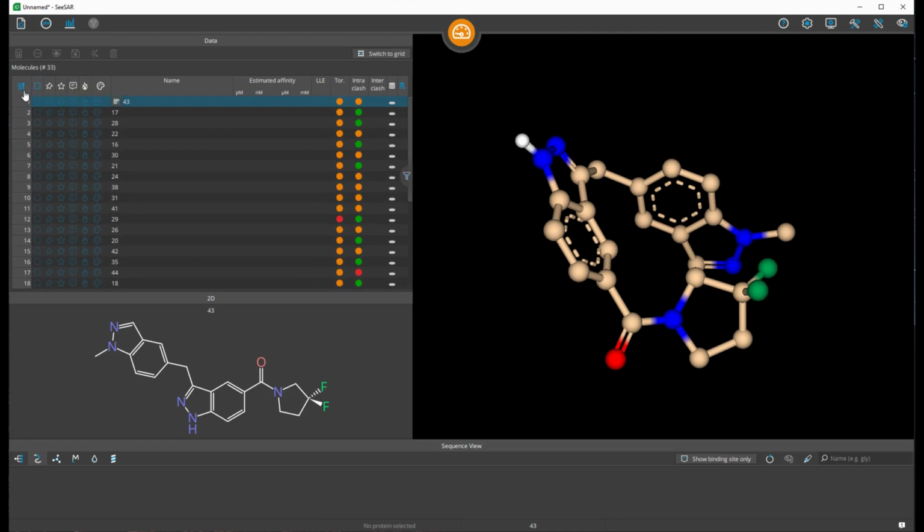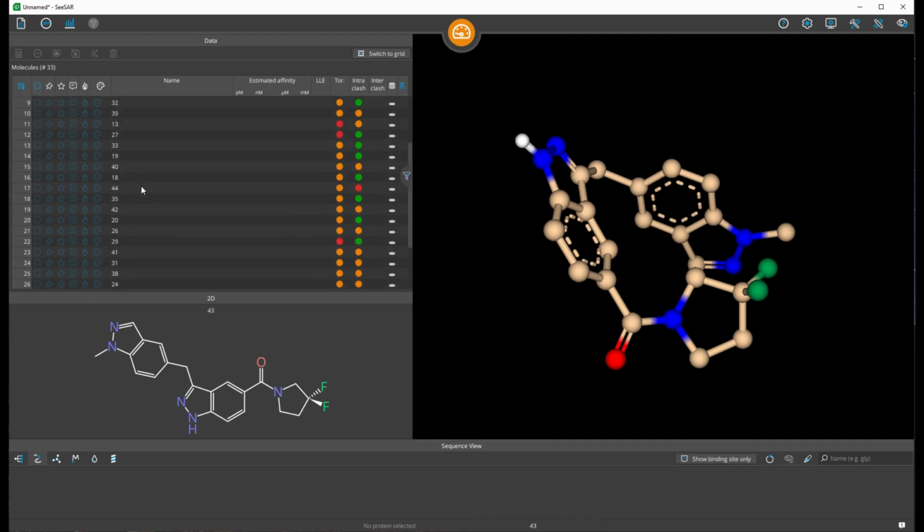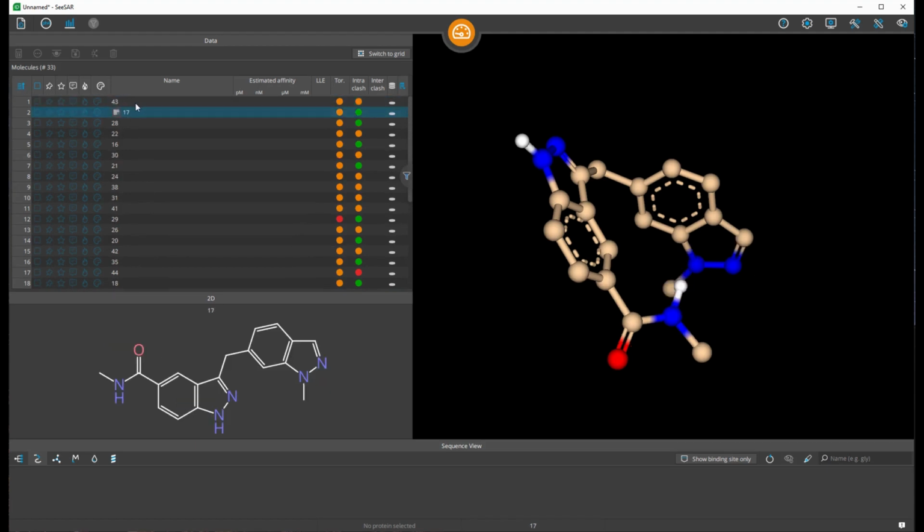Hovering the mouse on the serial number column header tells us the order in which the table has been currently sorted. The tooltip text now reads, "Table sorted to show oldest entries first." And clicking on this button will now reverse the current sort order, which is also indicated by the change in the corresponding tooltip text, which now reads, "Table sorted to show newest entries first." So that is a quick way to change the sort order of your table entries and to also find out what the current ordering of your table is.